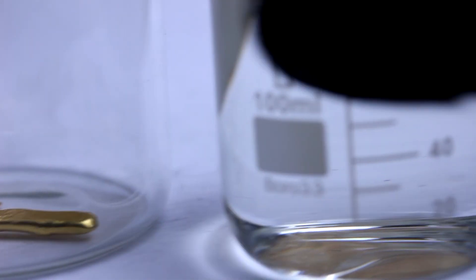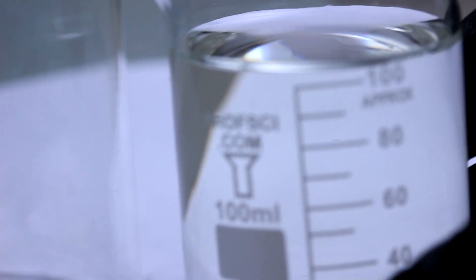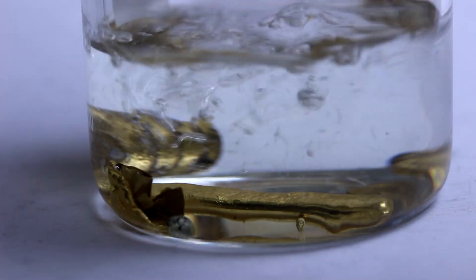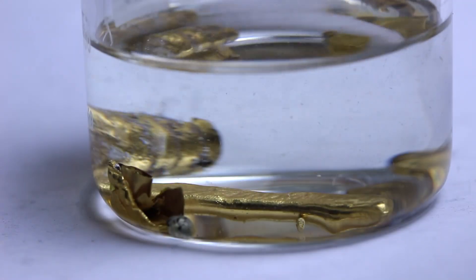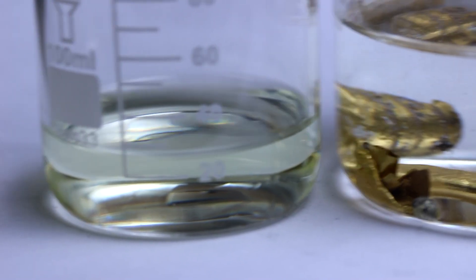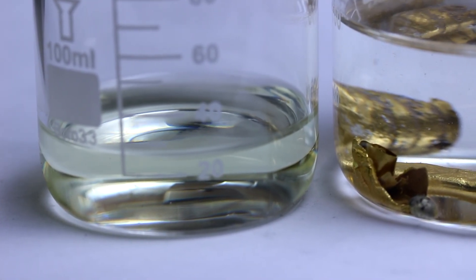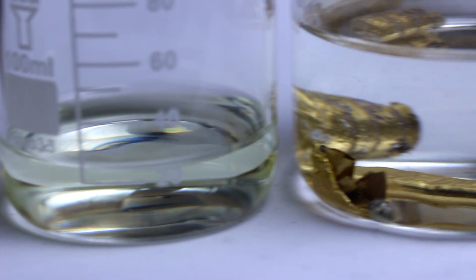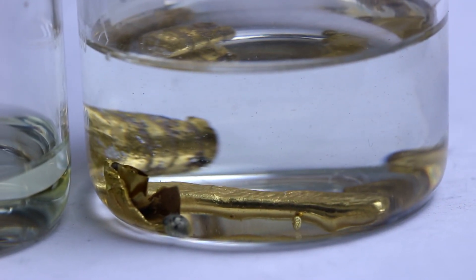To dissolve this amount of gold, I'm going to need roughly 100 milliliters of hydrochloric acid, which I'll throw in now. There should be little to no reaction. Now to get the gold to dissolve, I'm going to have to use a strong oxidizer. For that, I'll use nitric acid. I'm just going to add it in a little at a time so that it doesn't get all consumed with the side reactions. You should need around 30 milliliters of this for this quantity of gold.